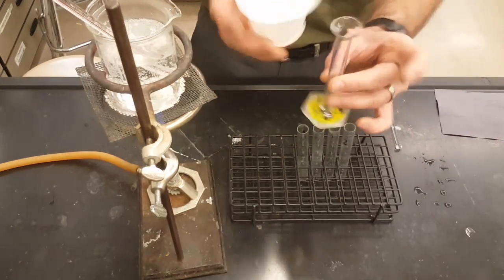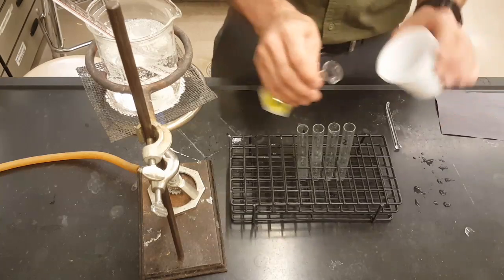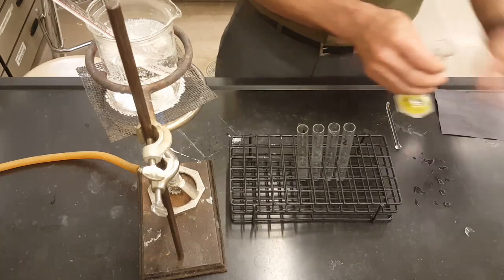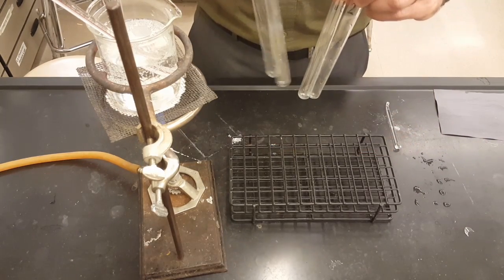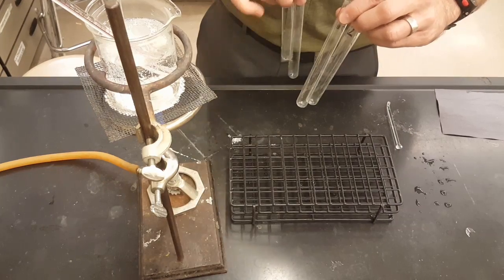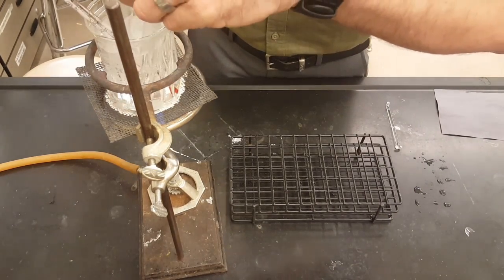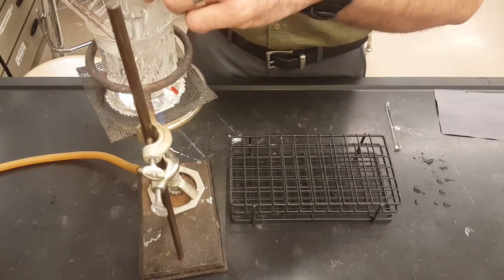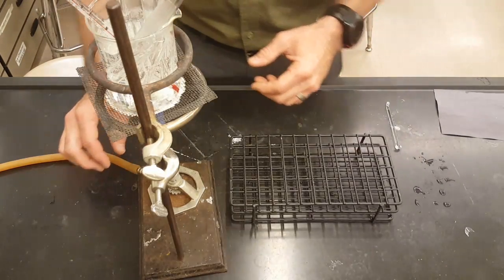Measure out your 5 milliliters in here. Pour 5, 5, 5, 5. The salts will not dissolve right away, and that's why I have a beaker of boiling water over here. So go ahead and put your test tubes in the water where you have a couple thermometers sitting as well.